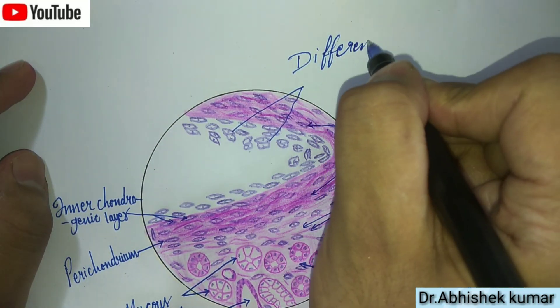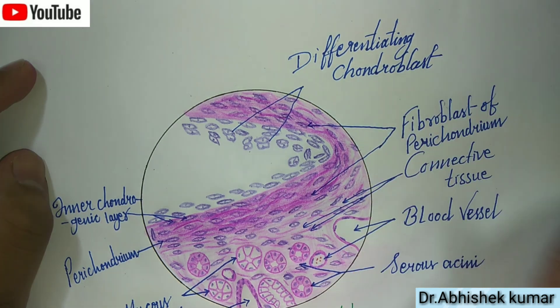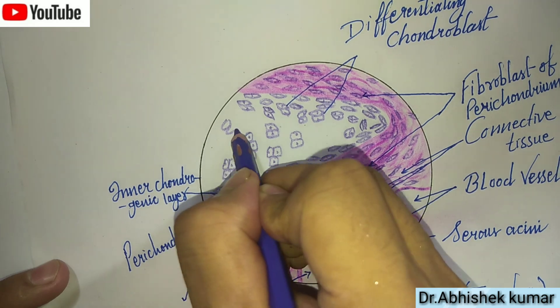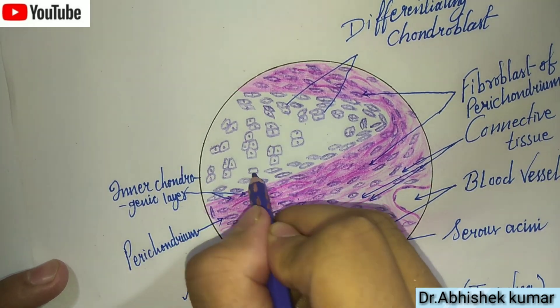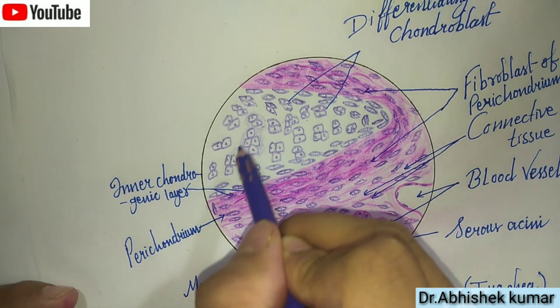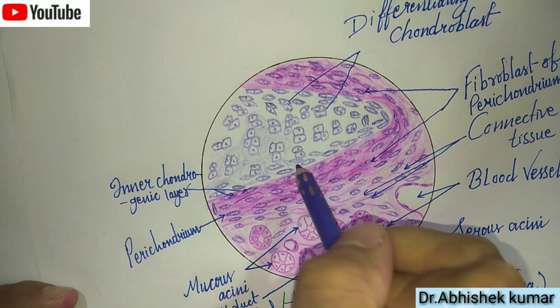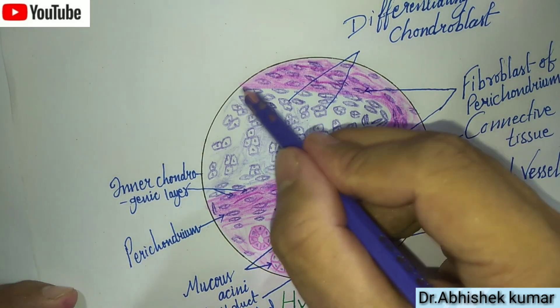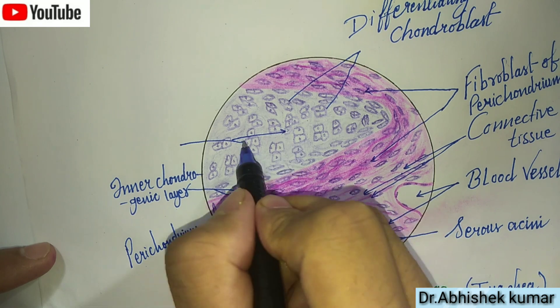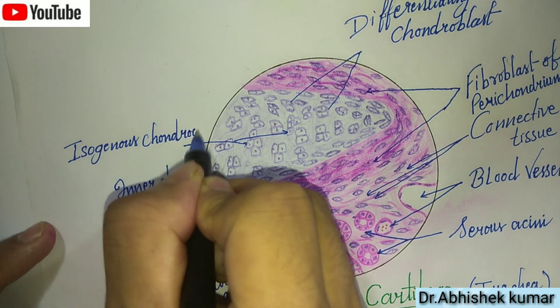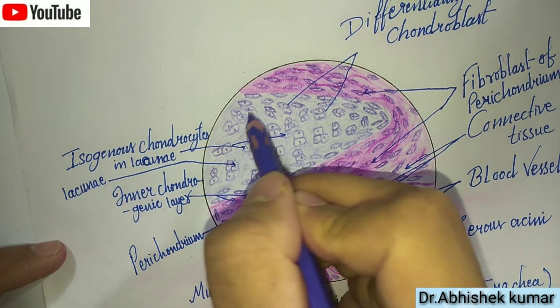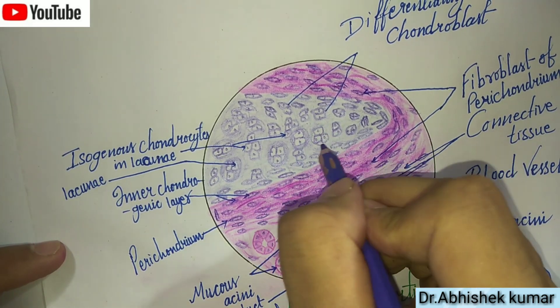This is the differentiating chondroblast. Here are the isogenous chondrocytes in the lacunae, and this one is the lacuna.